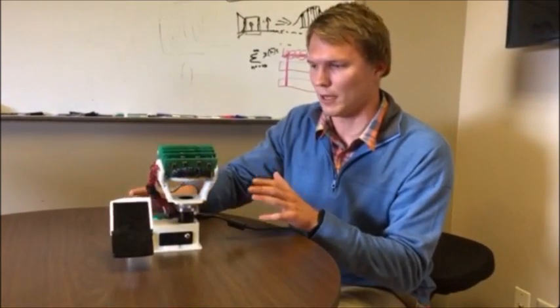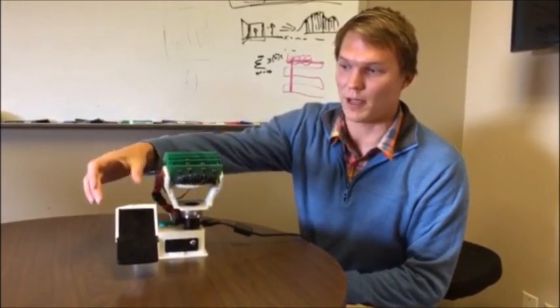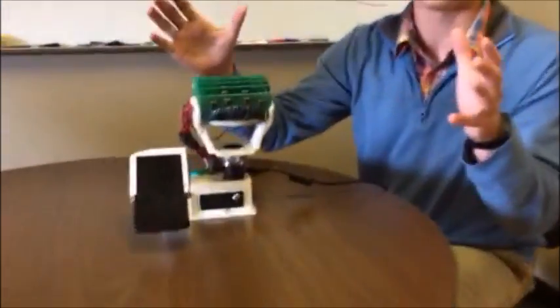Yeah, so this is the same CellScope that Dan has used in a lot of his previous research. It's basically just a standard commercial objective coupled with a very inexpensive optical system and a 3D printed enclosure, which uses a smartphone as the camera. Our addition has been this LED array on top, this massive monstrosity of a circuit board thing.